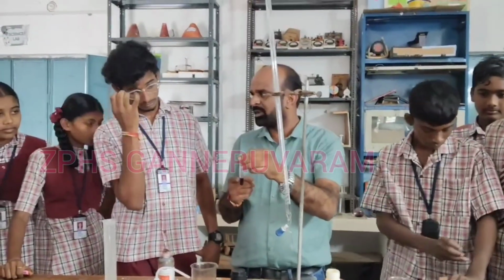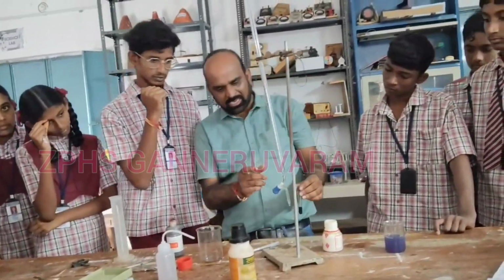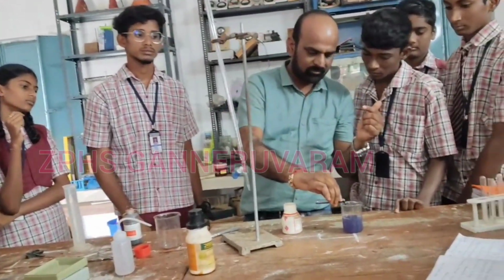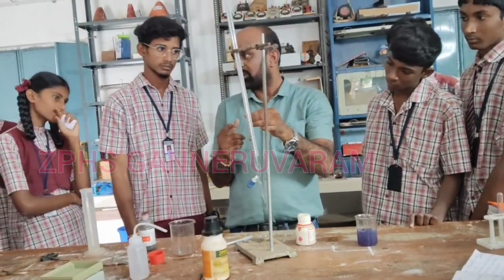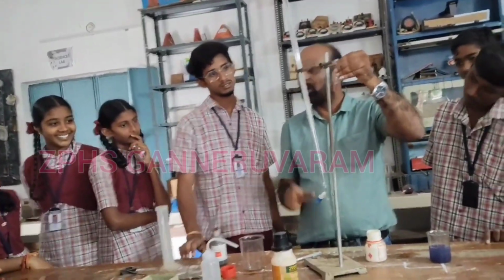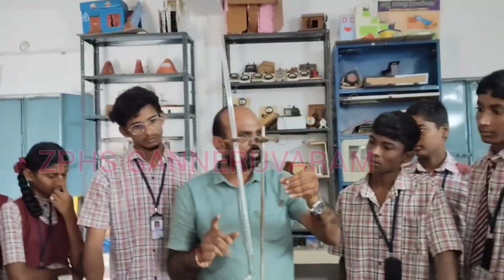Already we have taken the sodium hydroxide solution and added red litmus to it, and it changes to blue color. Whenever we add a little bit of this solution, I will take a little bit. Whether it changes to red color or not, we will test. Does it change to red color? Yes. So always we have to do the experiment with a little bit of quantity. This is a precaution we have to observe.